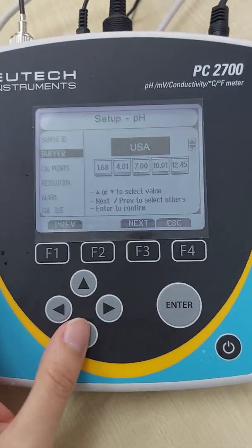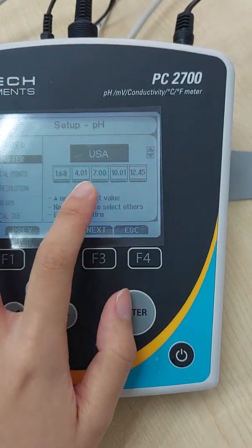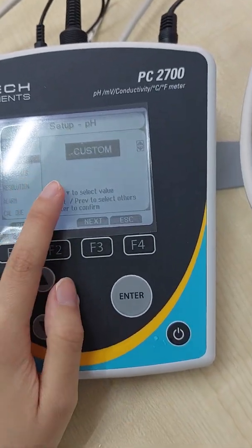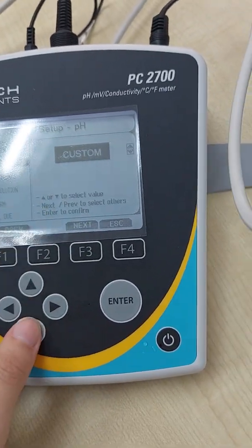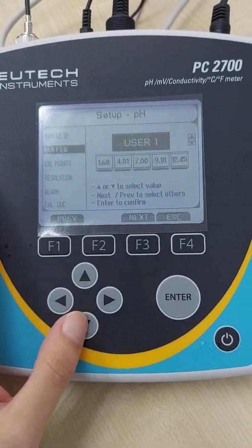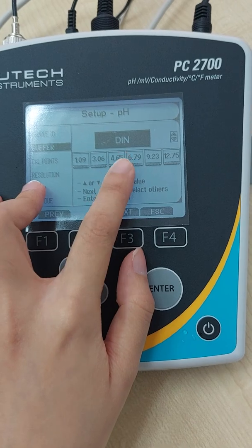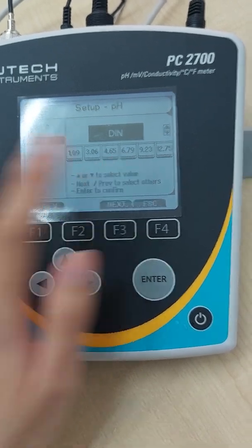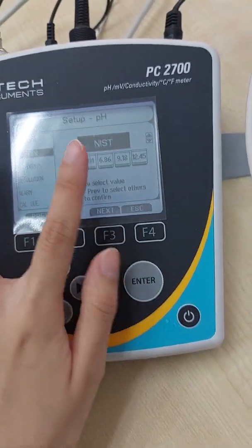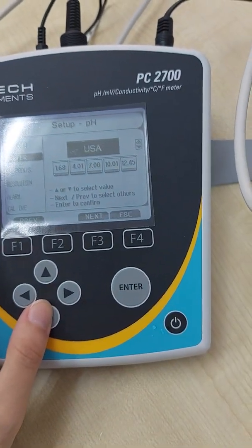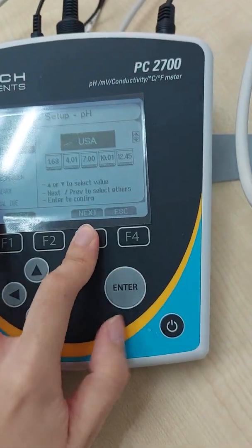So buffer group, there are a few types of buffer group. The standard one will be the USA, the most common one. You can also customize your own buffer group depending on user. You can save up to two user, and then we have the DIN standard. You see the number is a bit different, and also NIST standard. So we'll go back to USA.